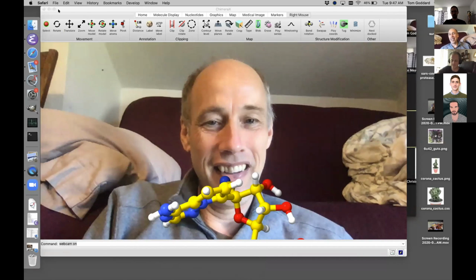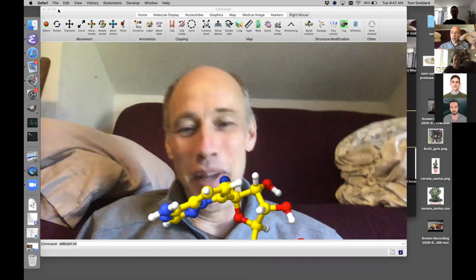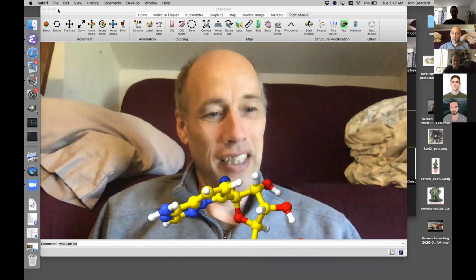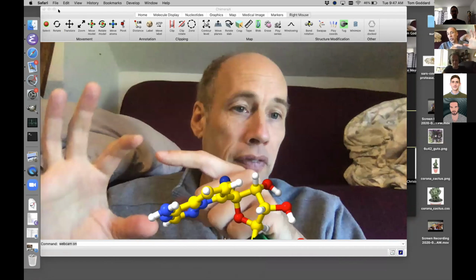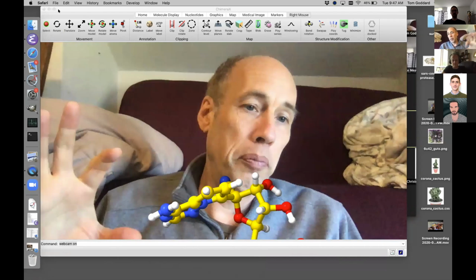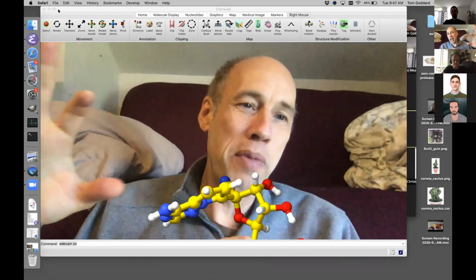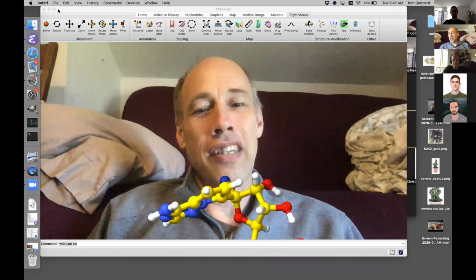Oh, good question, and I meant to say that. Sadly, I just added the webcam thing, so you need to get today's daily build. The daily builds are on the ChimeraX download site. You actually have to scroll to the bottom of the download page because our 1.0 version is at the top. That came out a month ago and doesn't have this webcam thing. I tested it on Windows just yesterday.